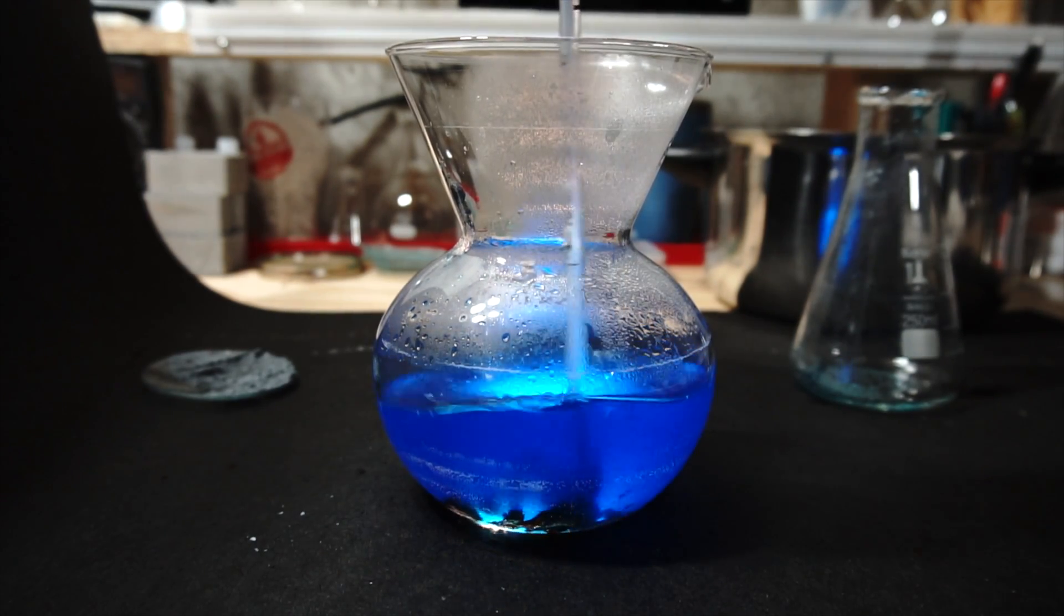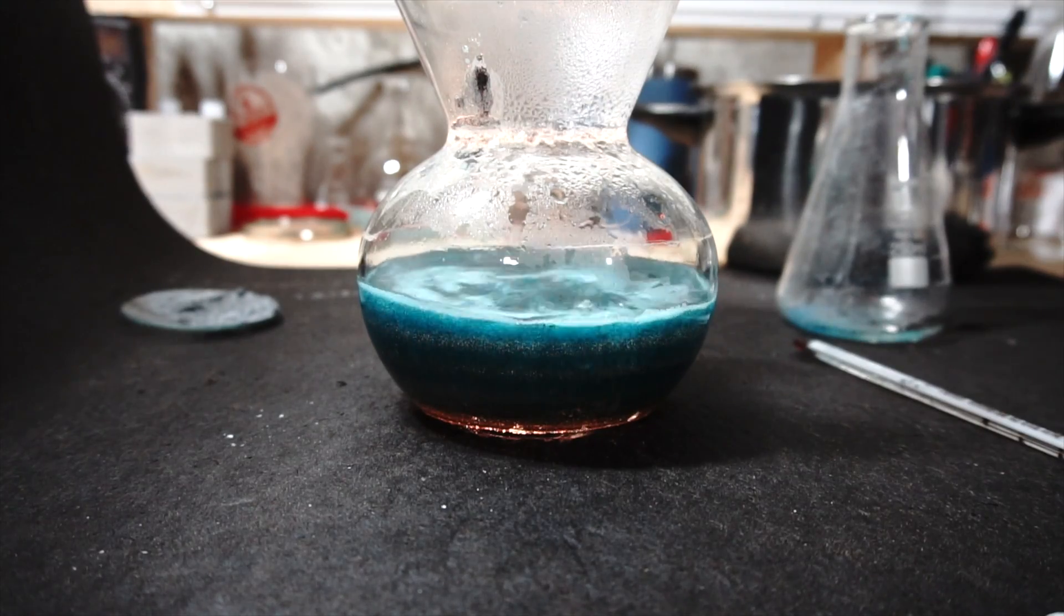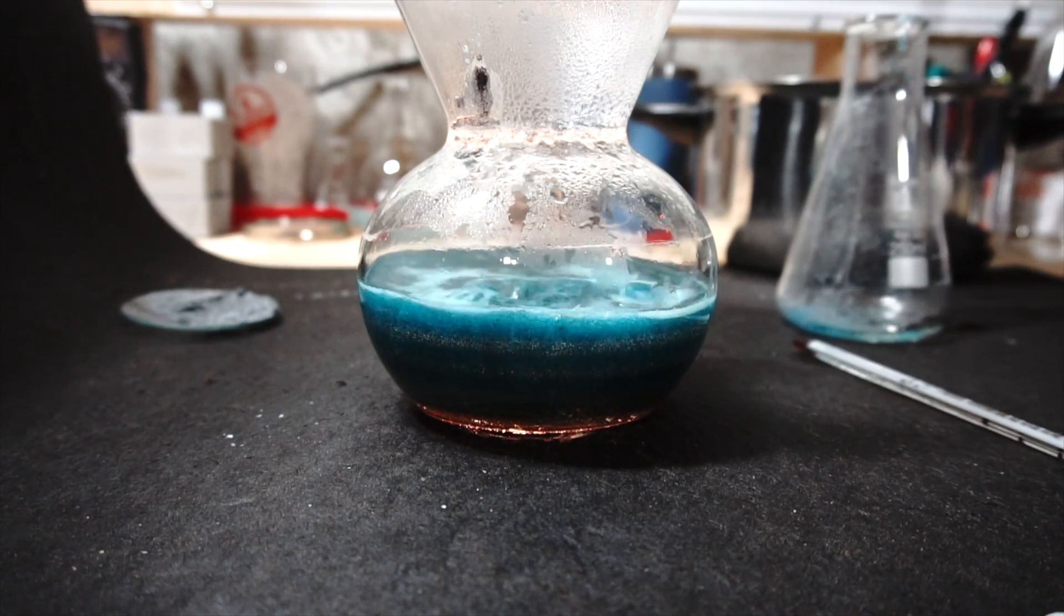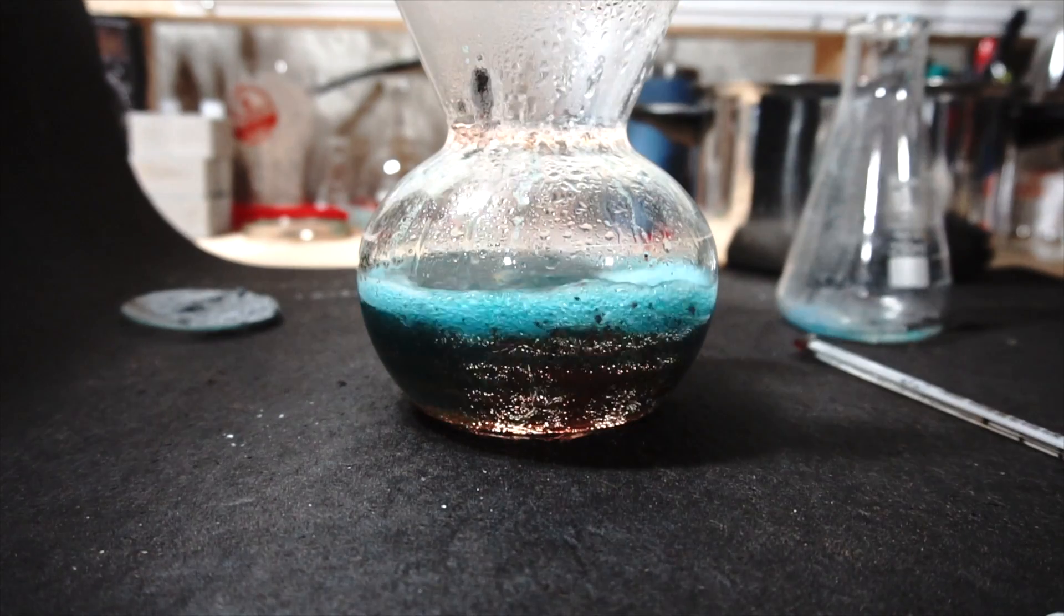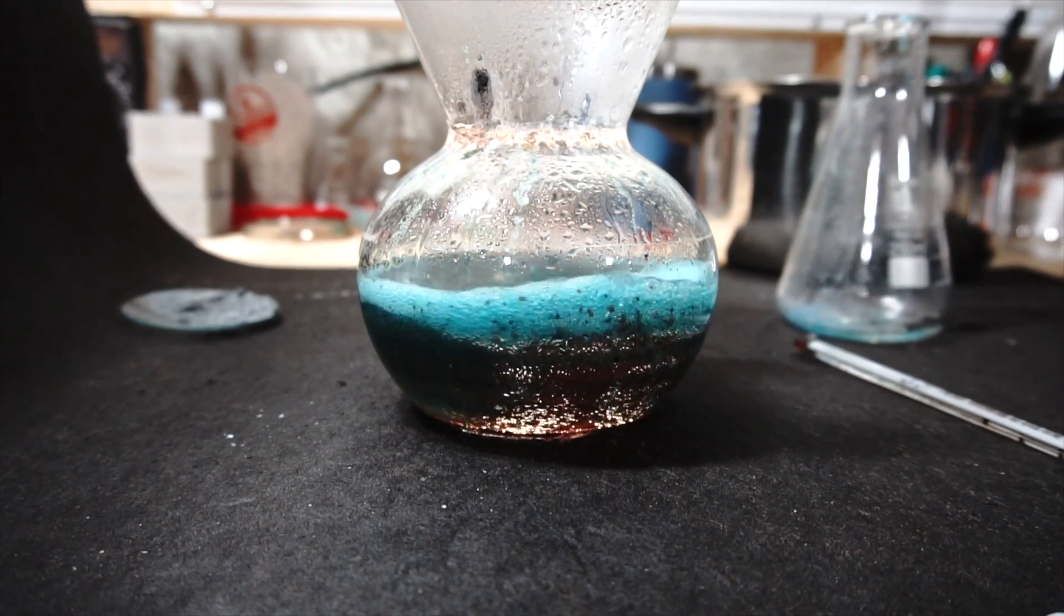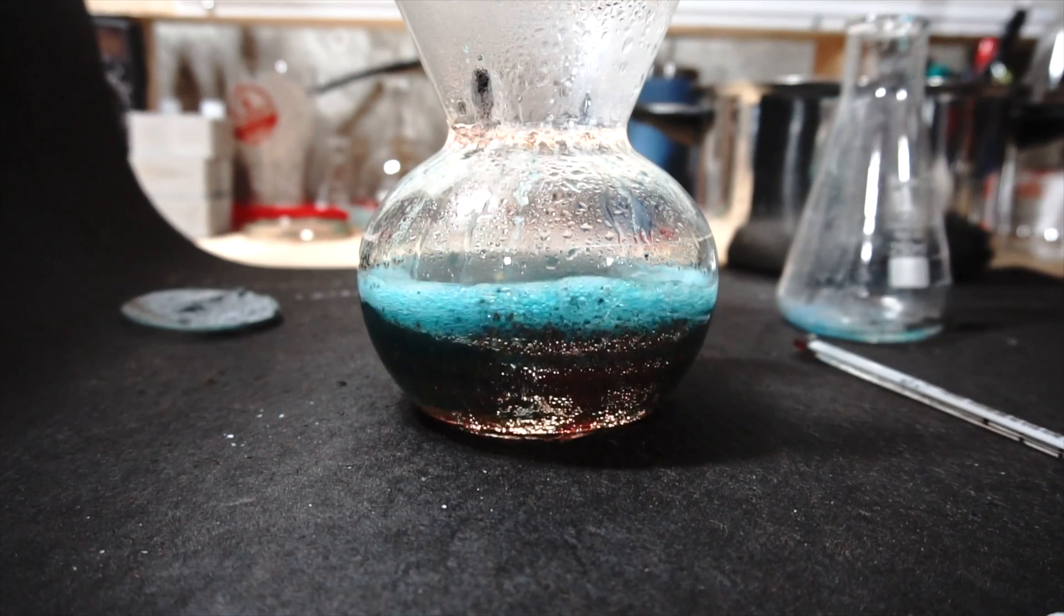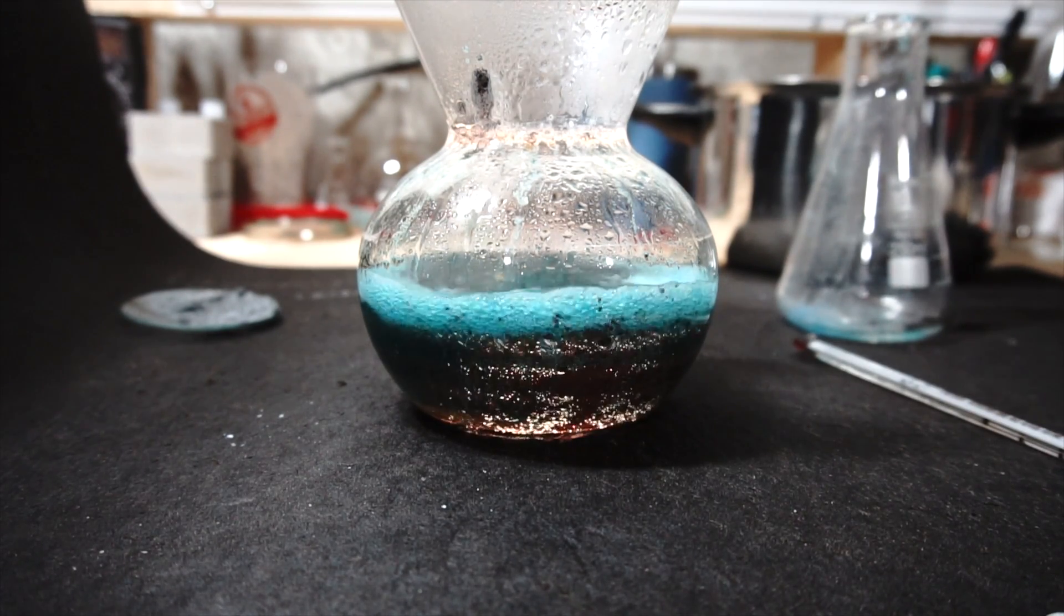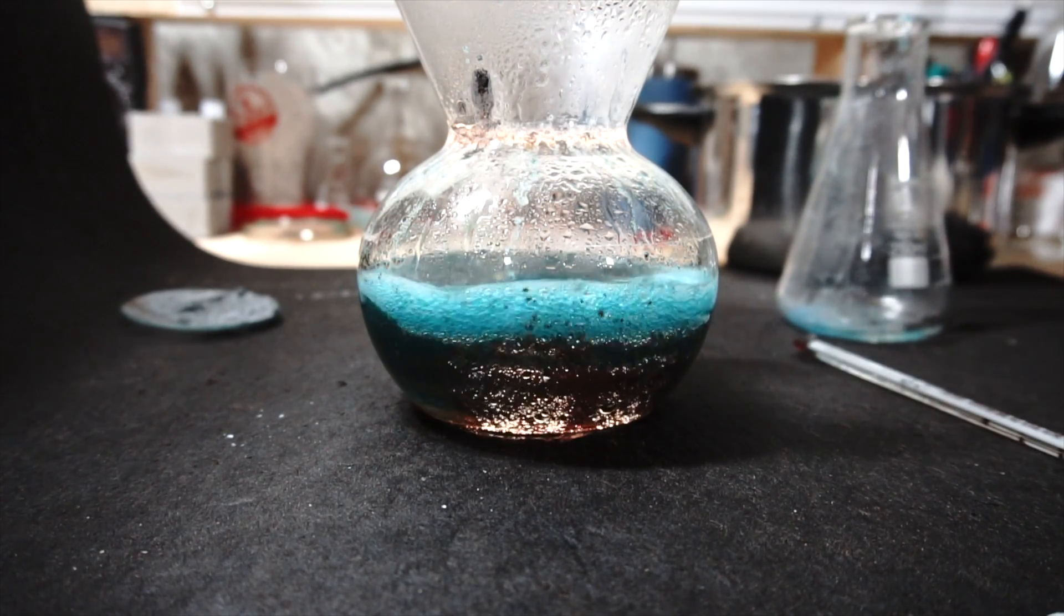Now, what's happening in this reaction is the copper sulfate is being attacked by the zinc metal. The zinc is essentially ripping the sulfate ion off of the copper and taking it for itself, which leaves copper to settle out of the solution. And you'll notice it's this nice rust color you see at the bottom of the flask.